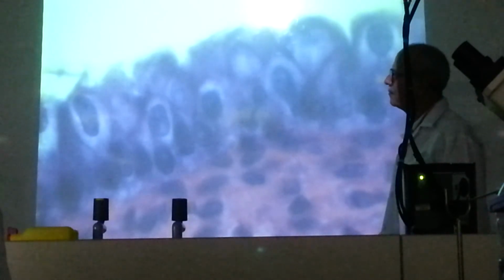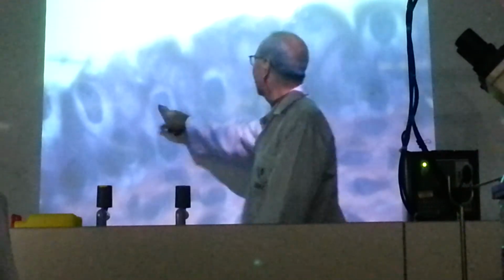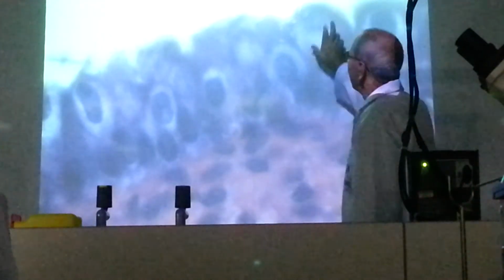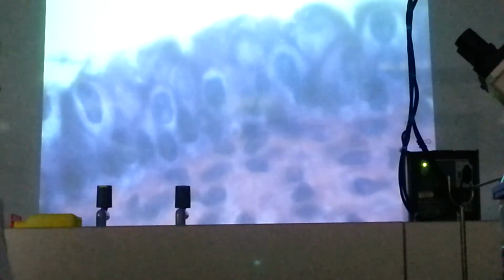No. First time. Right there. It may be removed. This is similar to that. Okay, I remove the section to get a better size.